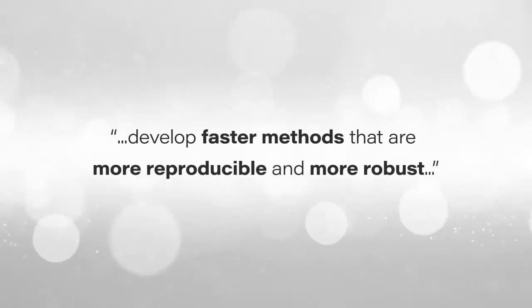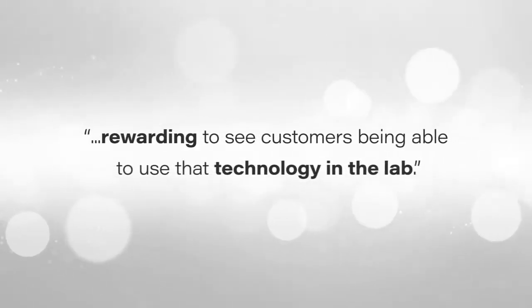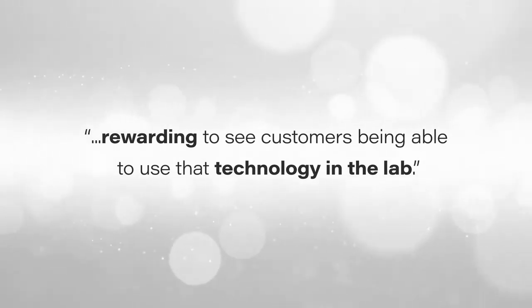Acuity Premier has actually addressed many of these challenges that our customers approach us with, because the performance gains using that technology have allowed us to develop faster methods that are more reproducible and more robust, and specifically in my area of expertise, peptide mapping, which is one of the most ubiquitous methods in the biopharma industry, from characterization and development all the way through manufacturing. And it's just really rewarding to see the customers be able to use that technology in the lab.